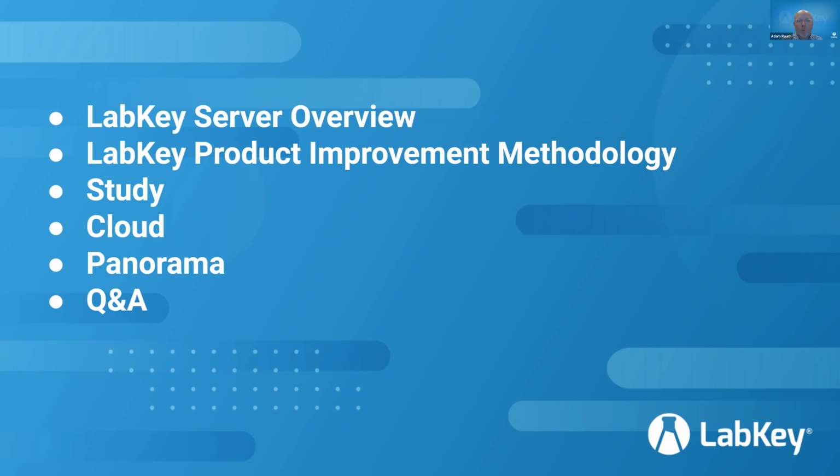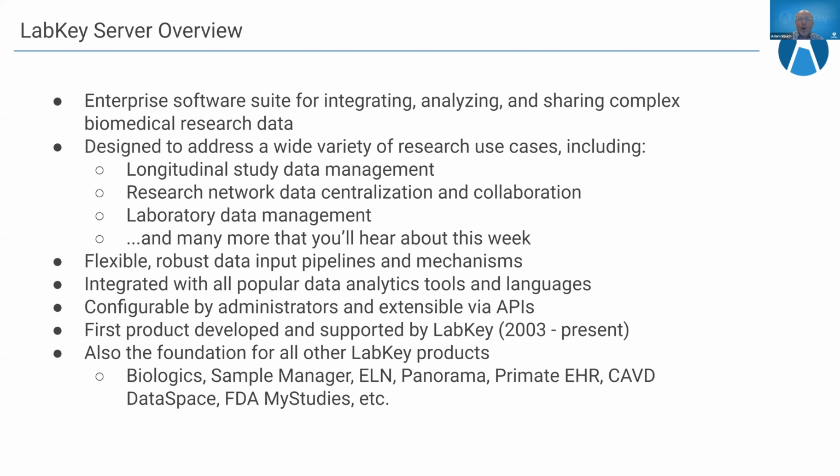So I'm going to jump in with just an overview of LabKey Server. Again, for those who are maybe not as familiar with LabKey, fundamentally at the highest level, LabKey Server is an enterprise software suite for integrating, analyzing, and sharing complex biomedical research data. So you're going to be hearing a lot about integration and analysis and sharing and collaboration. Those are keys in a lot of these presentations. So hopefully that's a theme you'll see over and over again. This really is a data integration system.